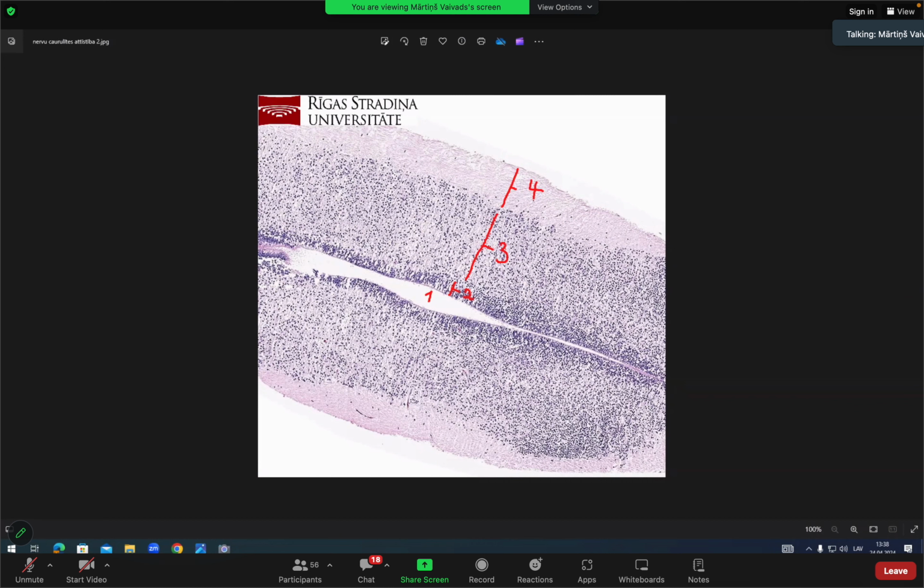There's another detail. There's sometimes small fragments of tissue. I will basically create a drawing here on top. If you see a thin layer of connective tissue on top, in the picture it's very hard to sometimes see. This on top, it's also on the spinal cord slides. I will put an asterisk, pia mater.